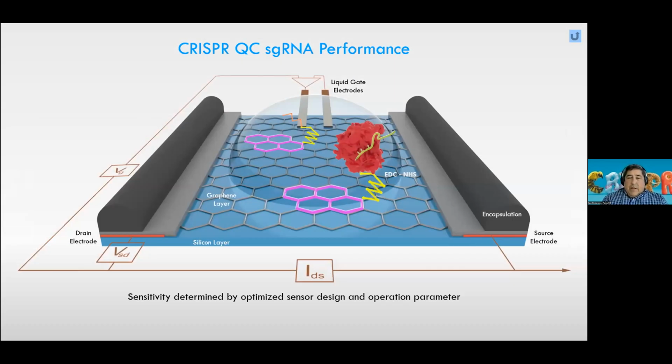All right, if I take it a step further, and what I mean by that is now I'm going to switch gears on you and take you to guide RNA data, where we actually look at different guide RNAs. And I think this one gets really interesting because, again, when you design a guide RNA with the intention of editing, you always get several options. The in silico will say, we would recommend you get these 6 guide RNAs to do your editing.